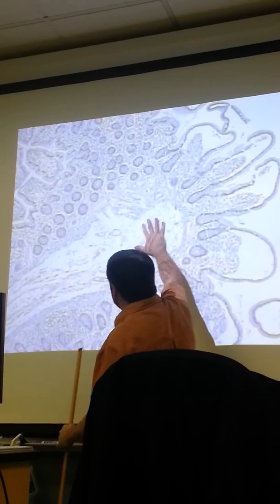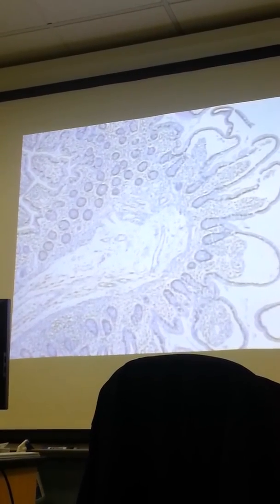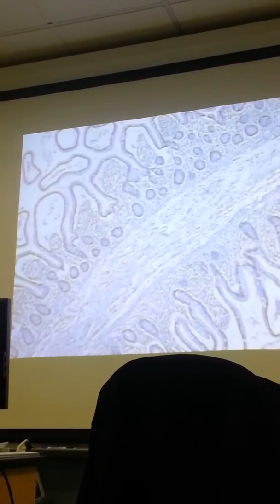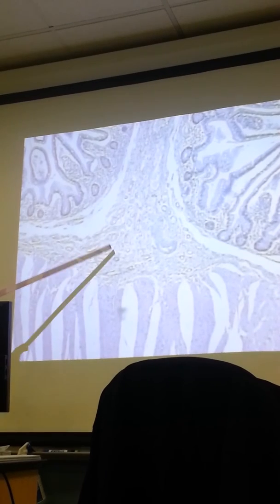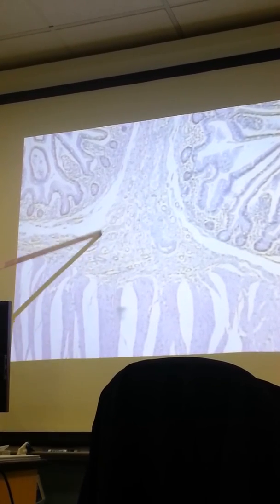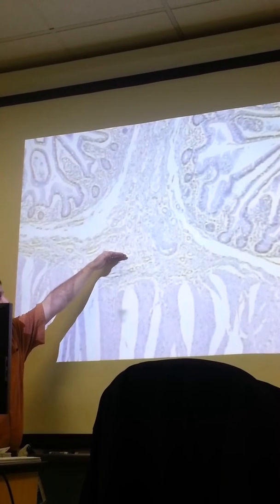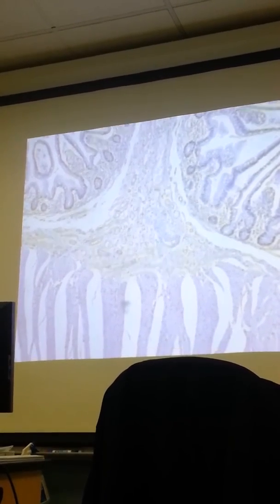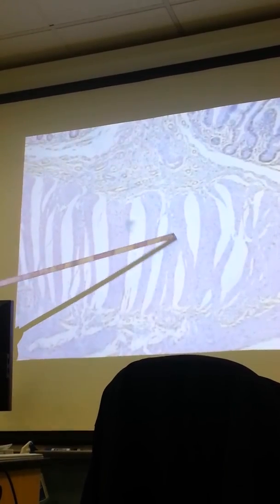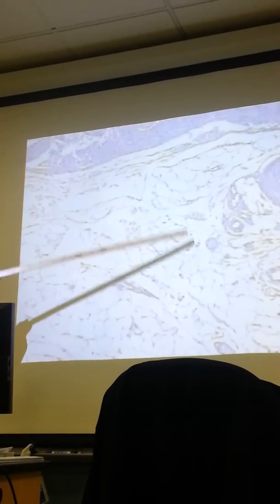Yeah. Then we've got here submucosa, which means it should be filled with blood vessels, arteries, veins, tubes of some kind. Tubes, tubes, tubes. Look at them, they're everywhere. Now, what's below submucosa? 2 layers of muscularis externa. Those are circular layer and longitudinal layer. And then the last thing is this serosa.